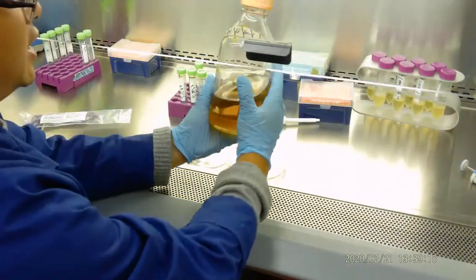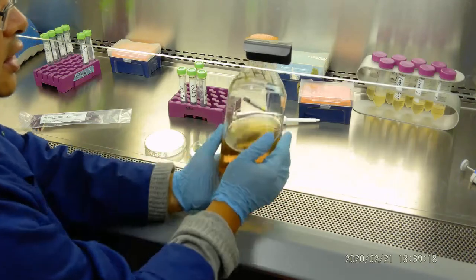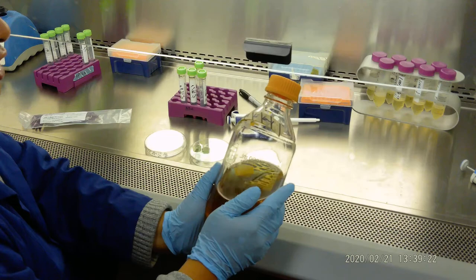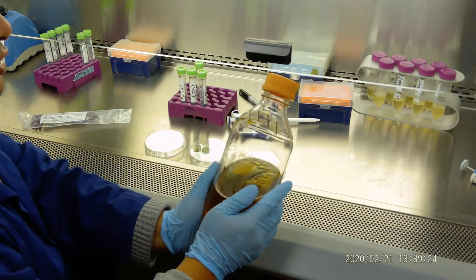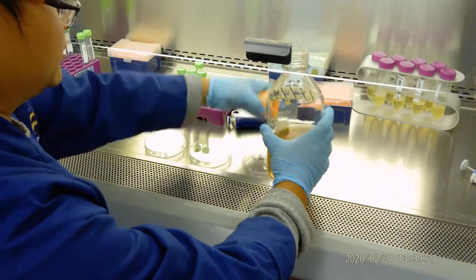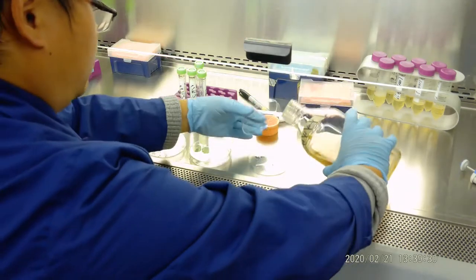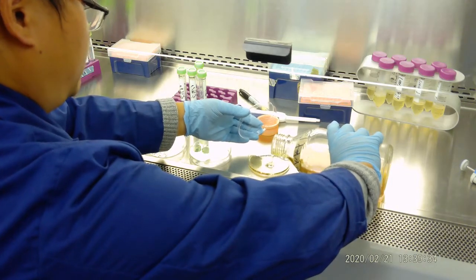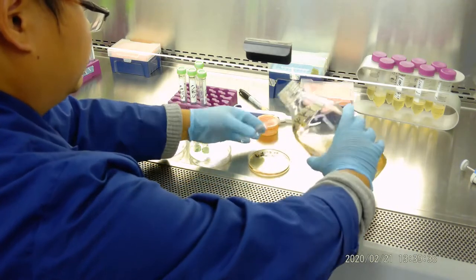This is melted agar. Melted agar, you can touch it. It is about maybe 40 to 45, 50 degrees Celsius. Now we're going to do the pour plating. How do we do it? We open it and we pour. We take a picture right here. We'll be pouring about 25.